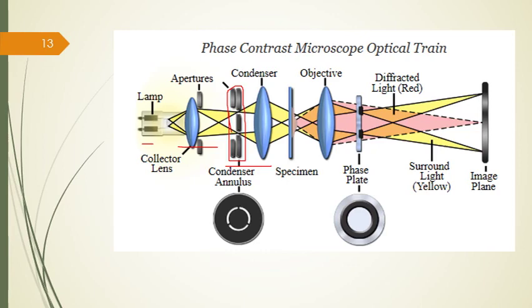The wavefront passing through the annulus from this assembly then illuminates the specimen. After passing through this assembly, it enters the specimen from here and here. After this, it either passes through undeviated, like here or here, or is diffracted or retarded, as in this pattern. This one is directed.